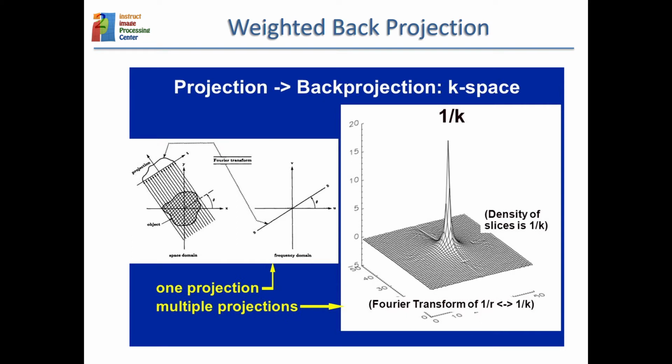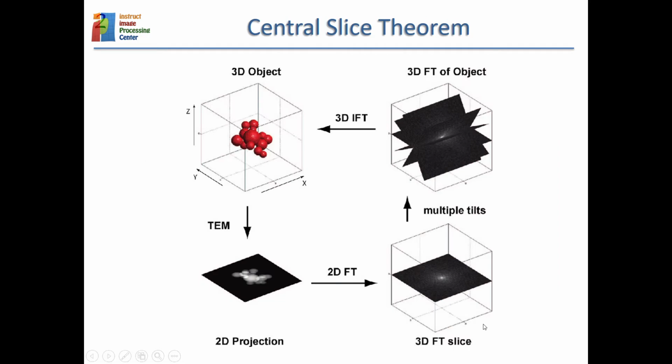And here is this idea that the overweight of the low frequency components decays as 1 over frequency. So the filter that we have to apply to the images, in principle, if we have a perfectly uniform distribution of projections, would be omega.